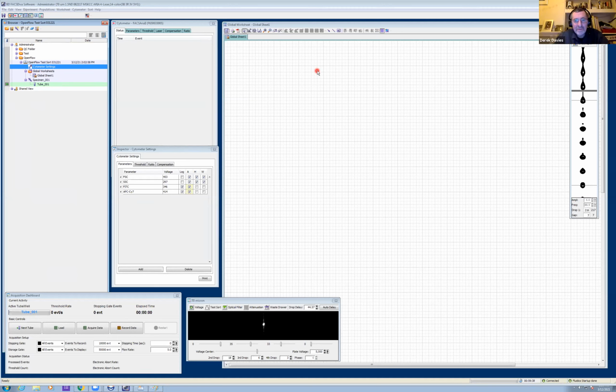Yeah, and these questions are always a balance with the question you're asking. Sometimes you can go quite quickly and have a high abort rate because you can get the number of cells you want quite quickly, because you have a load to start with. But if you're looking for a rare population, you don't want to lose cells, then you have to think a little bit more carefully about the way you set the modes. Exactly. Great. So back to you, Kathy.